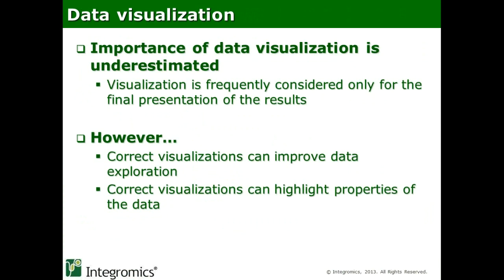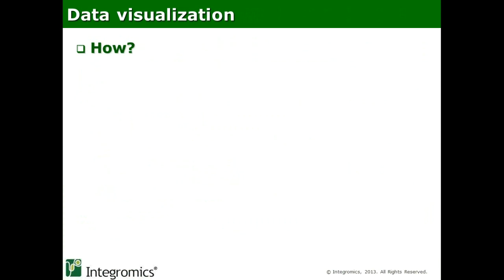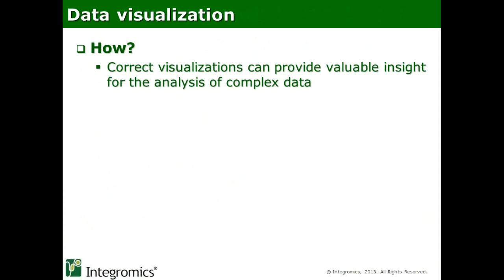However, if you can represent the data in a correct manner, this can improve data exploration quite a lot and speed up the analysis in many cases, as it can help to identify properties of the data, be it elements such as outliers or patterns or trends in the differential expression. So how can these visualizations help in this analysis?